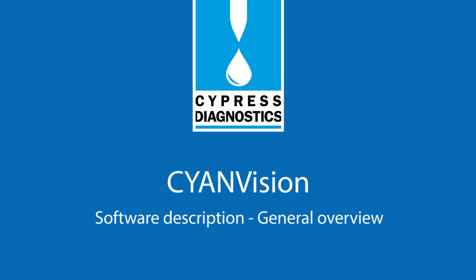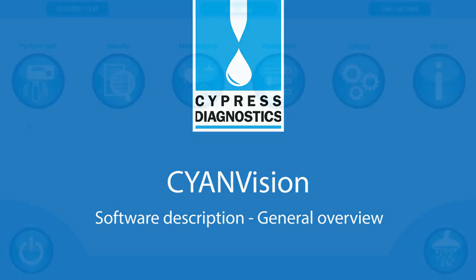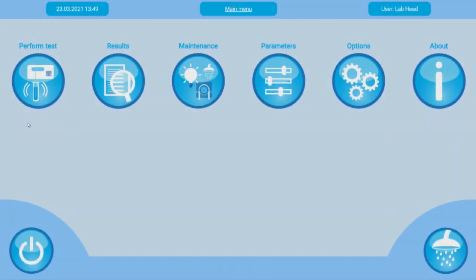This video is useful for new users to familiarize themselves with the basic menus of the CYANVision. You can find 6 menus starting from the main menu. You have Perform Tests, Results, Maintenance, Parameters, Options, and About.